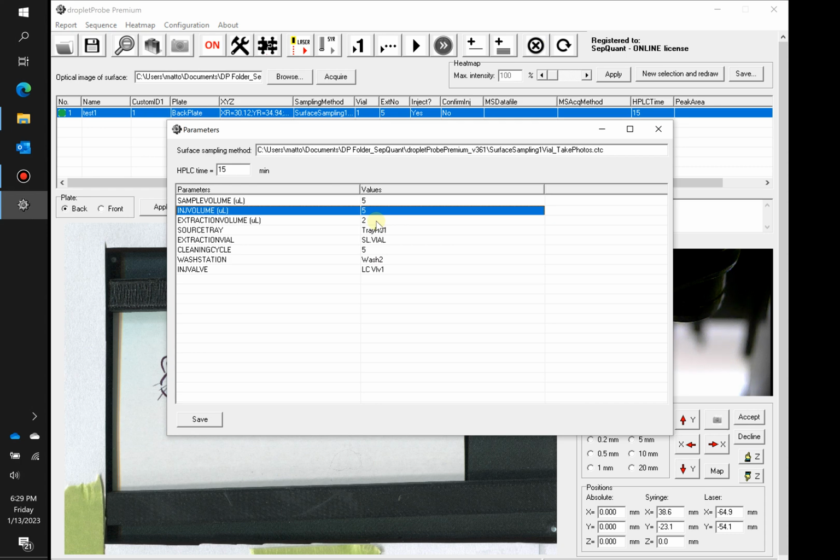There's some playing around that you might have to do in the method development on this, but essentially if, for example, your ratio of solvent to aqueous solution is higher than what you would prefer to have in your starting condition of your run for your HPLC, then you can actually choose a bigger loop size for your sample loop, and it will essentially mix with your initial buffer run conditions so that you could get away with using a stronger solvent.